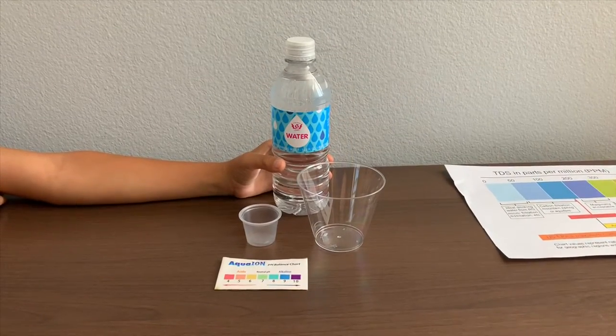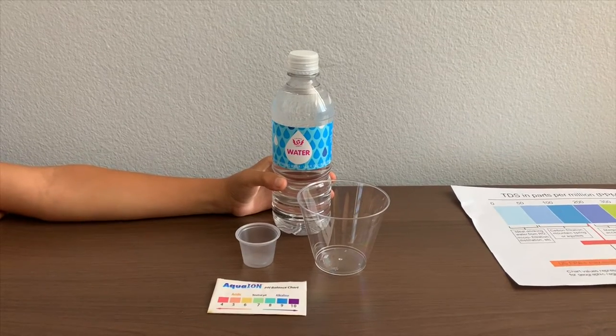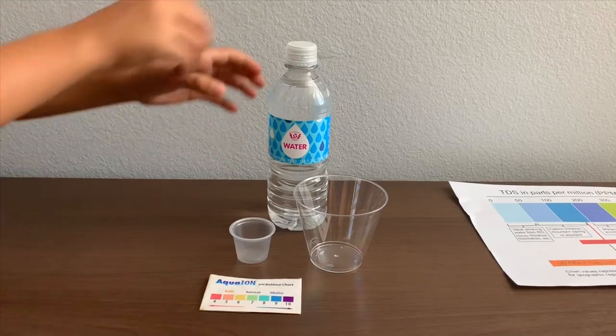This is 8 Sugar purified drinking water, purified by reverse osmosis. It costs $2.29. Let's test the pH and TDS levels.